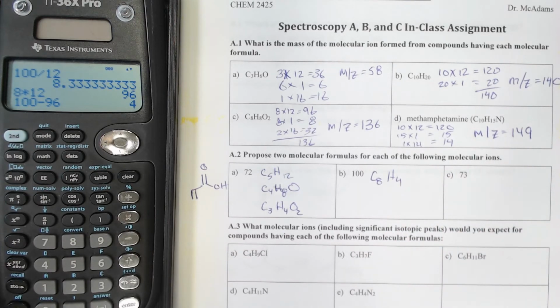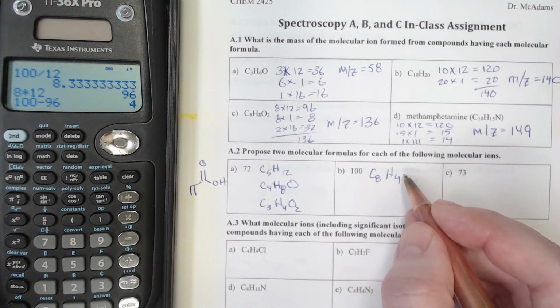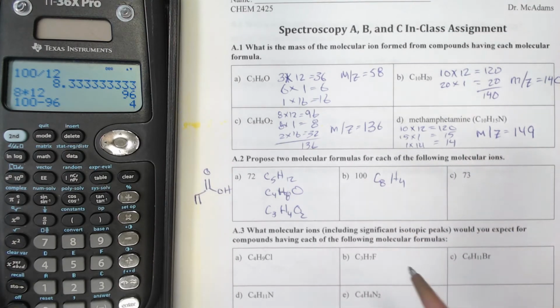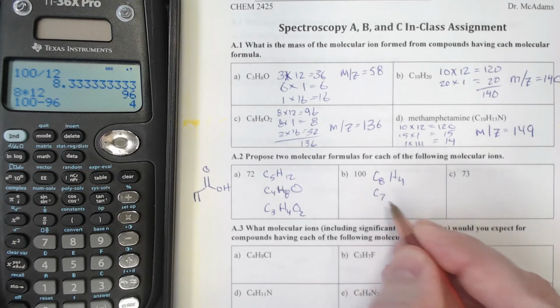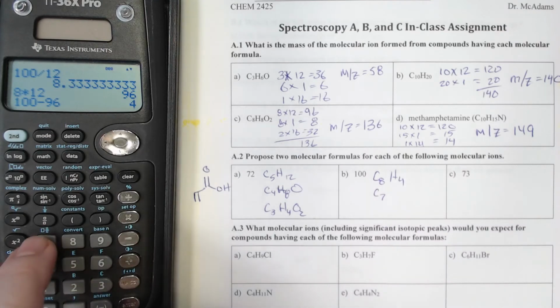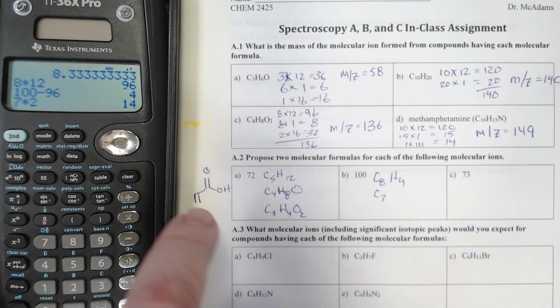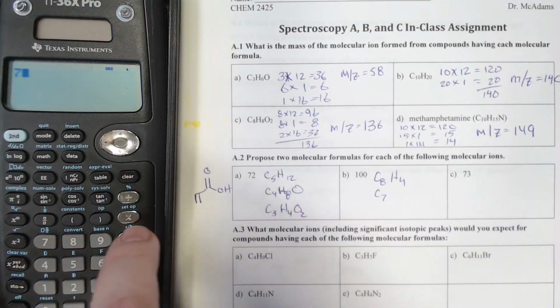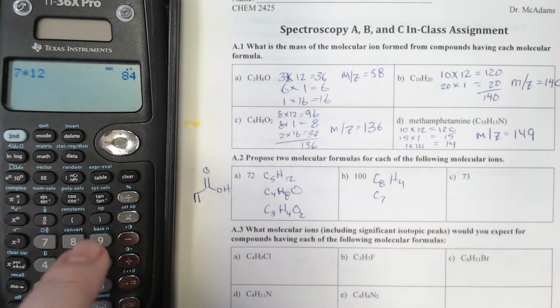Now, I don't know of any stable molecules that have that formula, but it's a possibility. I wouldn't put this high on our list. If we have an unknown with a mass of 100, that's not going to be my top suspect. So let's go down to 7 carbons. 7 times 12 gives us 84, and then let's subtract the 84 from 100.